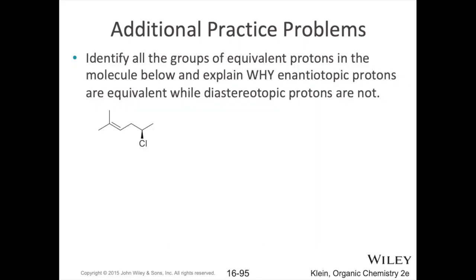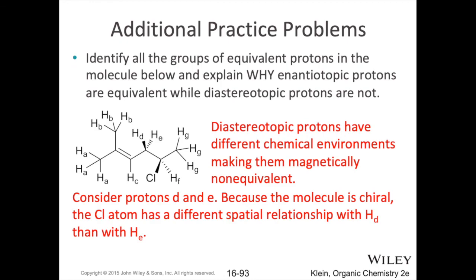All right, so here's an example of a molecule. Go ahead and see if you can identify which types of protons you've got. In other words, first of all, ask yourself, how many signals am I going to see here? Which protons are going to give rise to only one signal because they're homotopic or enantiotopic? Okay, so hopefully you've drawn that out. Here's that molecule again with all of the protons drawn out, so you can examine that a little bit.